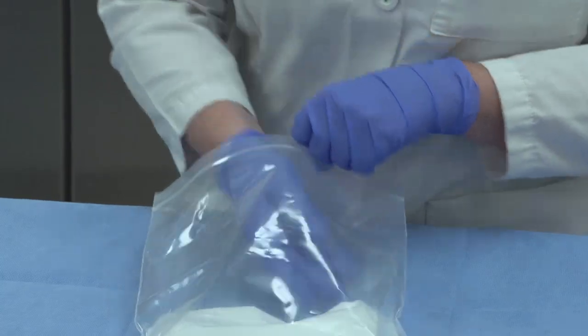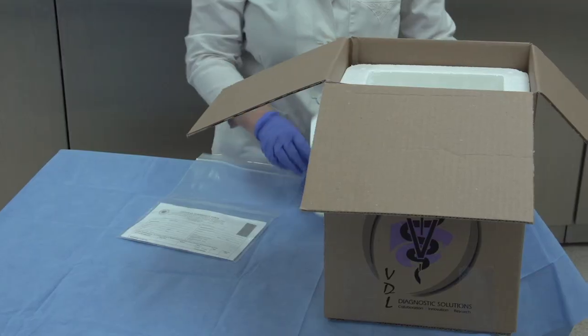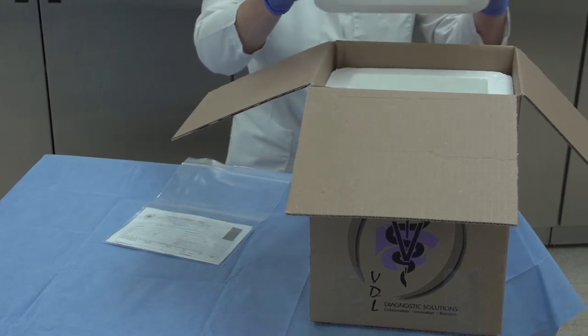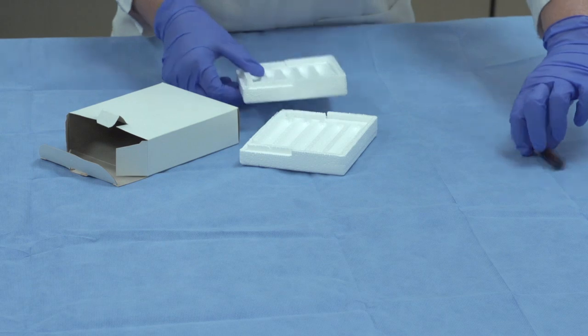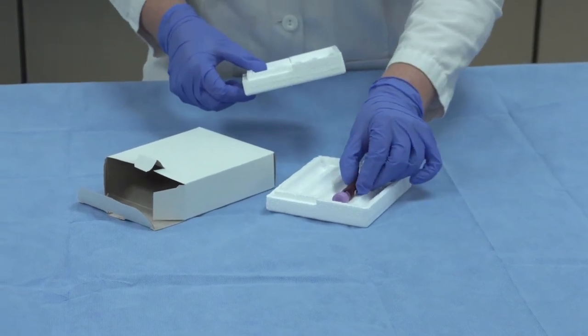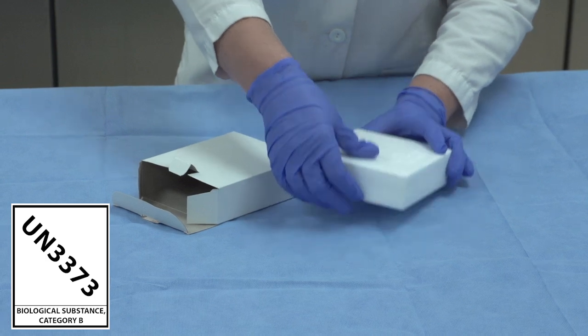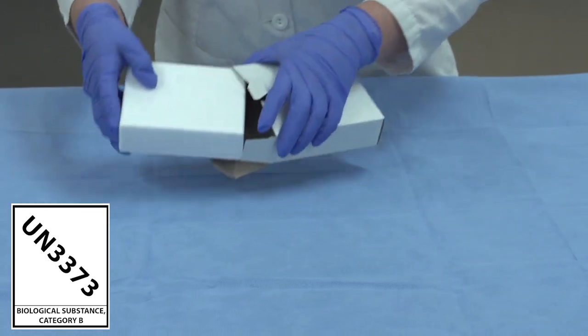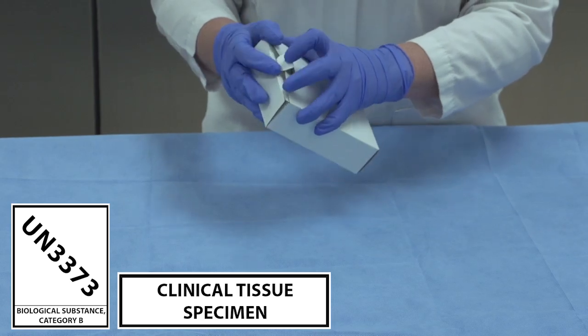Ice packs should be included in warm weather. Please do not send ice cubes. A styrofoam cooler or other insulating materials will help maintain the proper temperature. Blood and serum samples are considered potentially infectious, and the outer packaging should be labeled with UN-3373, an animal diagnostic or clinical specimen.